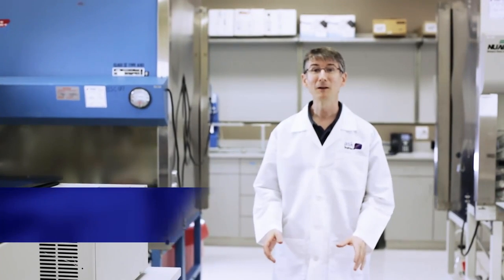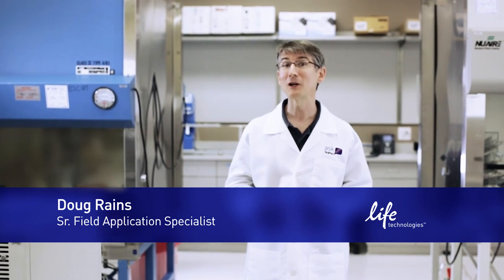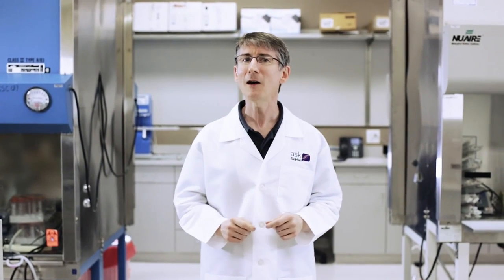Relative gene expression is one of the most common applications that researchers perform on their real-time instruments. So it's never a surprise when I receive a question like the one I got recently from Shan at Pennsylvania State University, who asked the following: since every cDNA is run with both the gene of interest and the internal control, do I have to be sure that the concentration of each cDNA is the same? Excellent question. Well, let's start with a little bit of review.